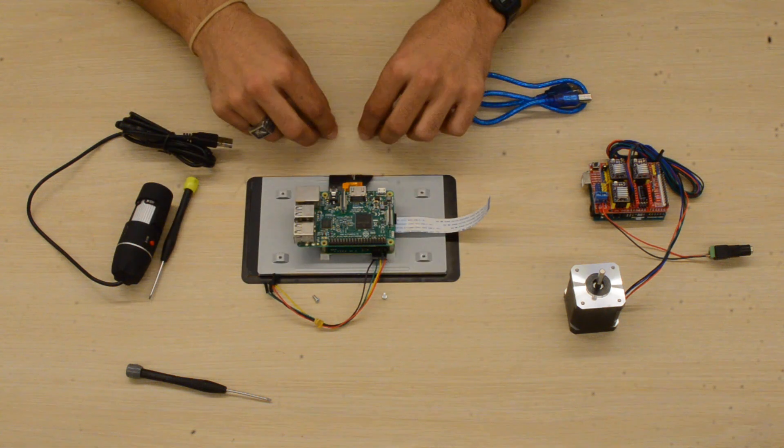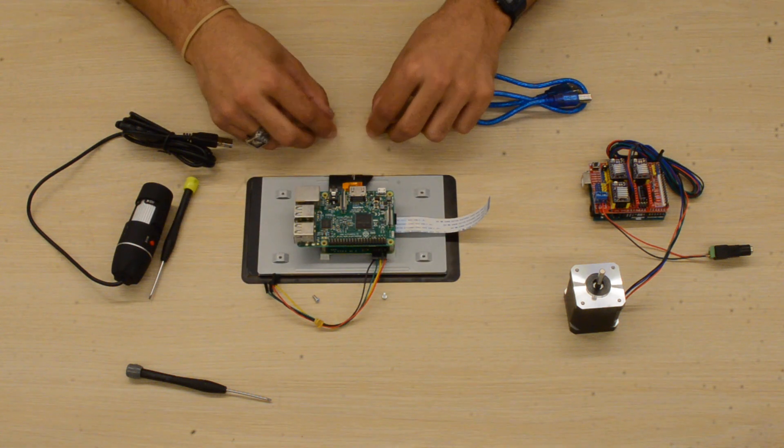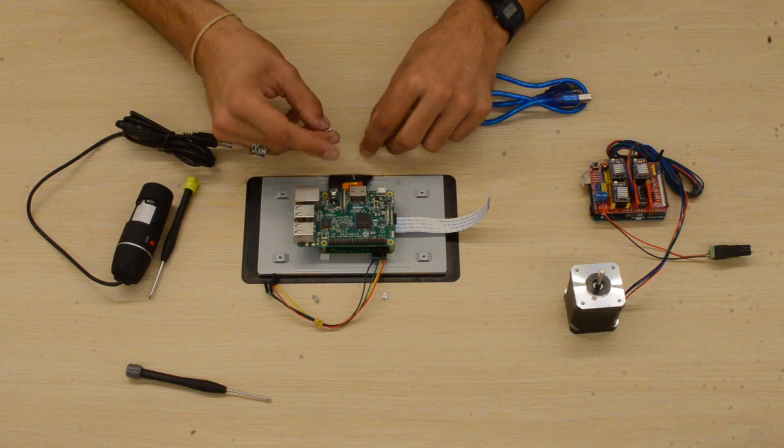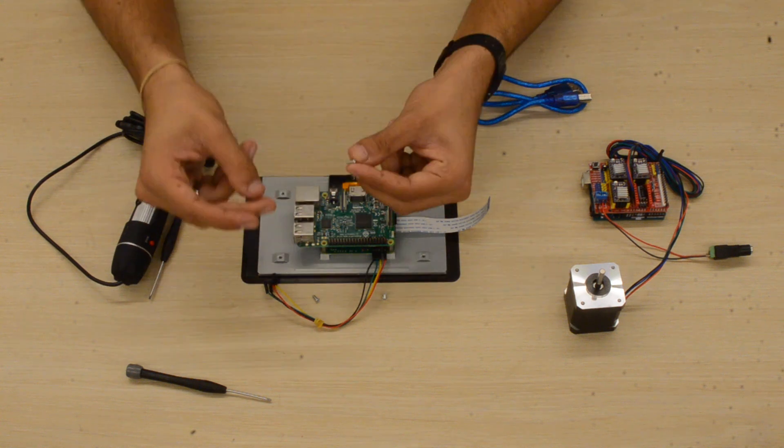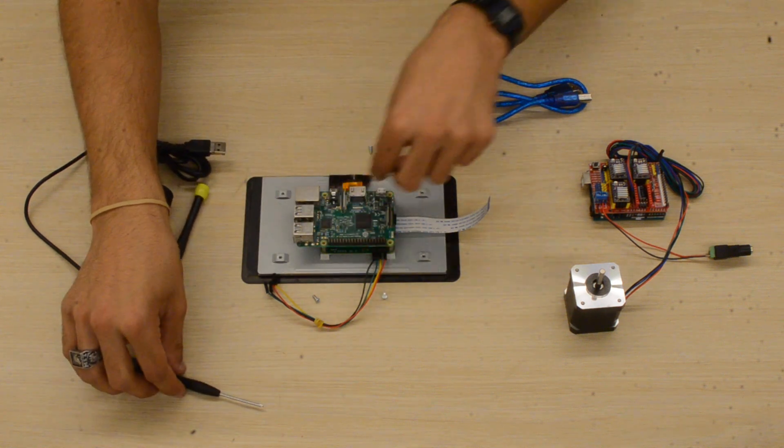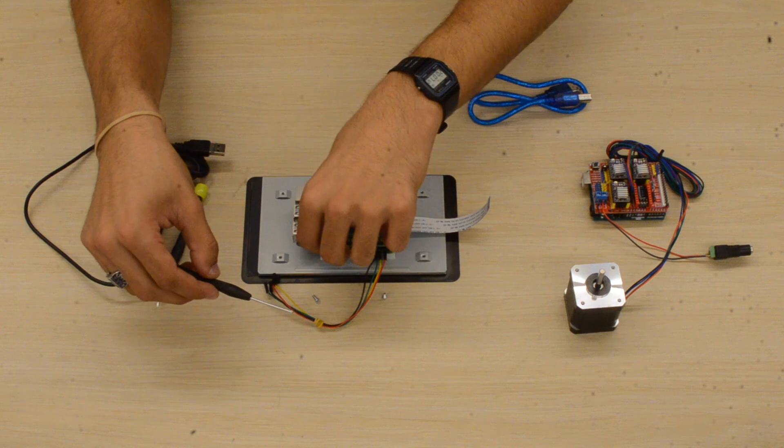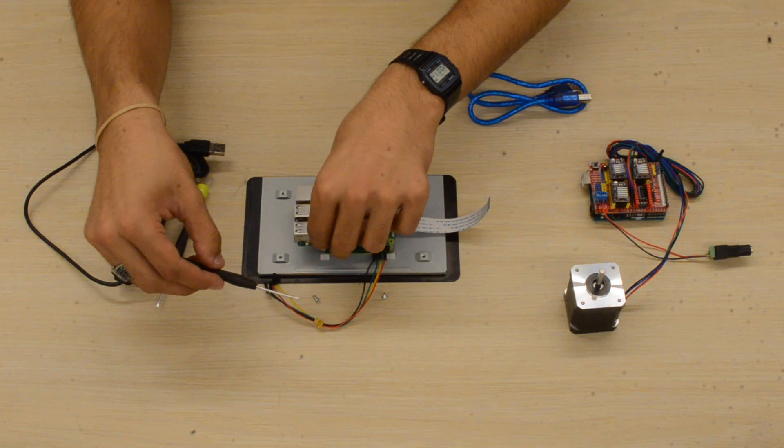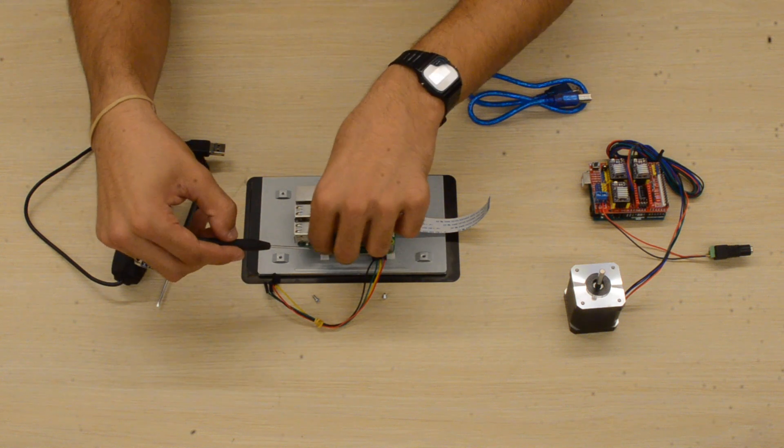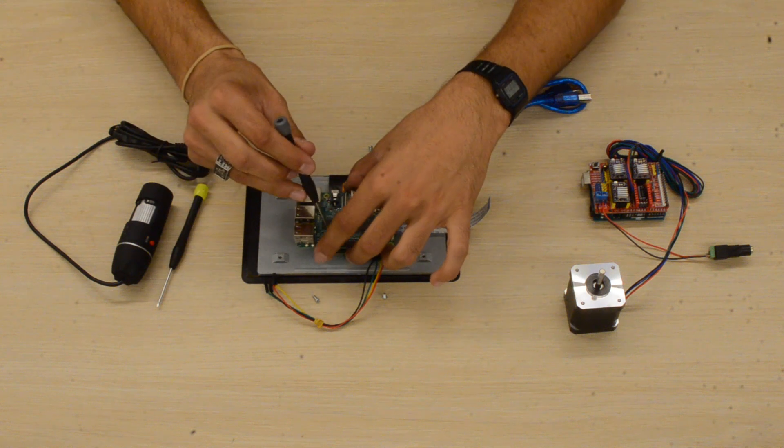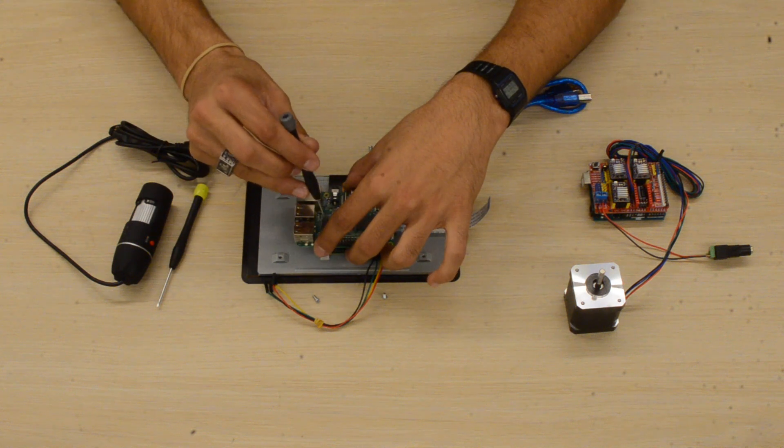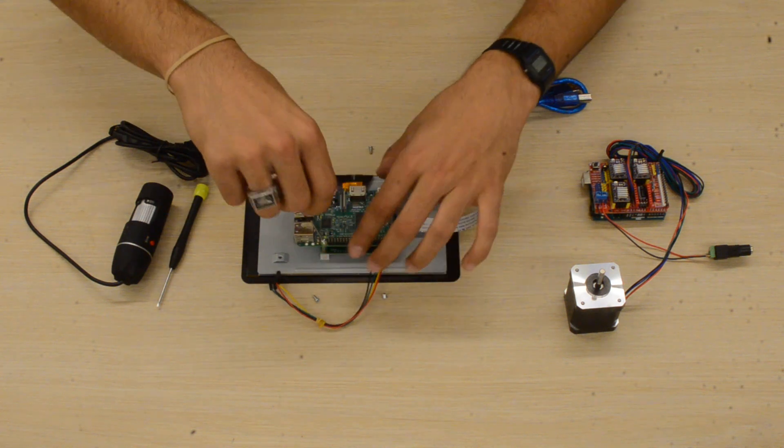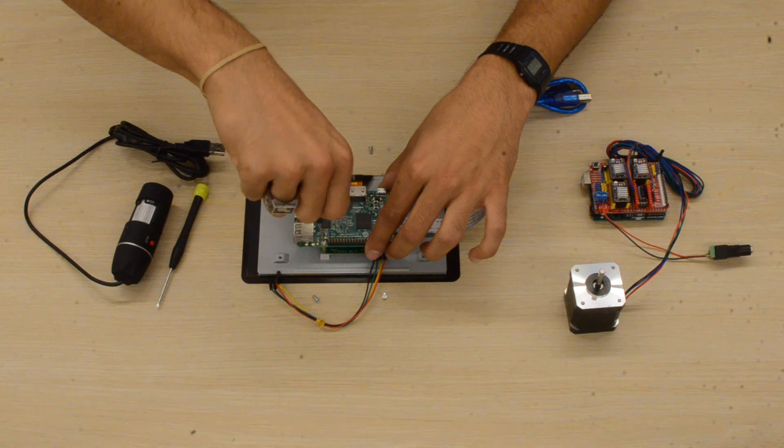And we'll take our four screws that come with the seven-inch display and screw them in with a Phillips head screwdriver. Make sure not to tighten them too hard, otherwise you could damage the board.